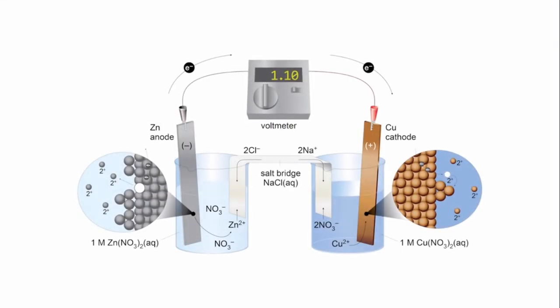Electrochemical cells produce electricity by spontaneous chemical reactions. Different half-cell combinations with different metals can be tested and the standard cell potential values calculated. The concentrations and the temperature of the solutions affect the standard cell potential values.